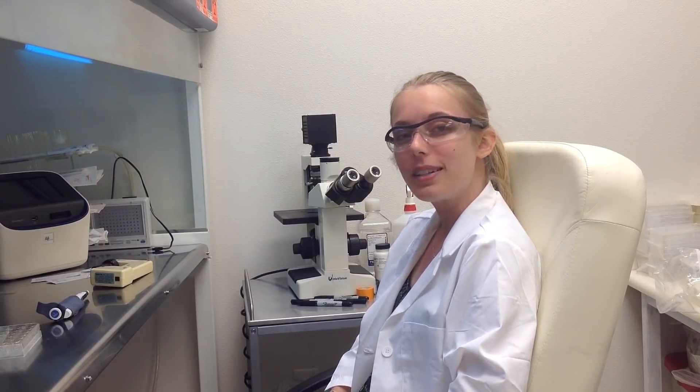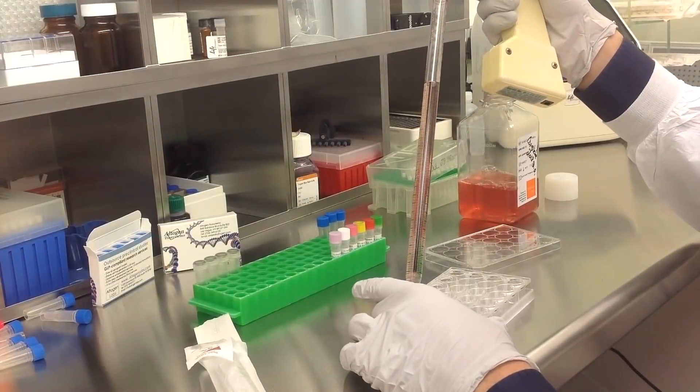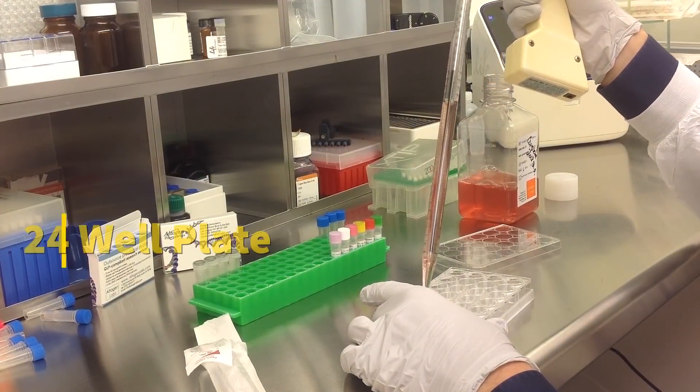Today we will be transfecting fibroblast cells obtained from ATCC. We will be using a transfection kit manufactured by Altagen BioSystems. In this tutorial, we use a 24-well plate.